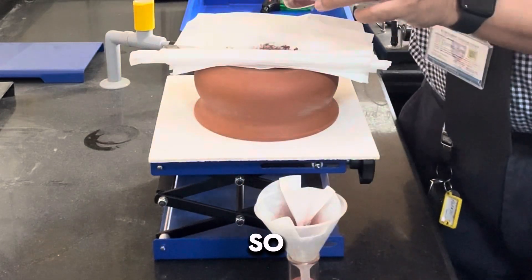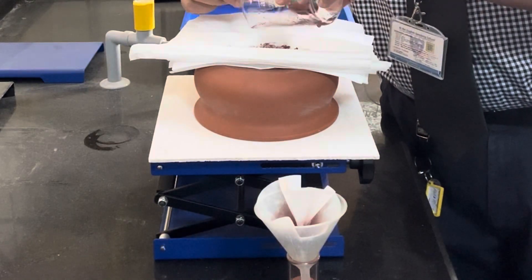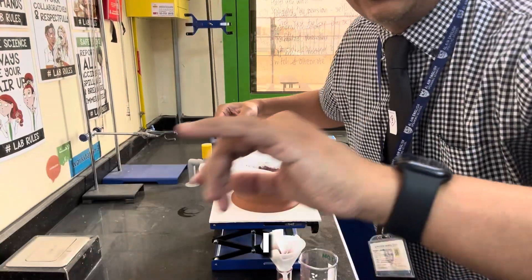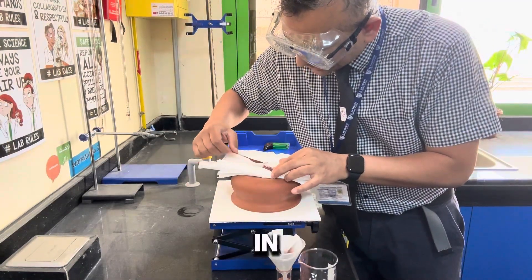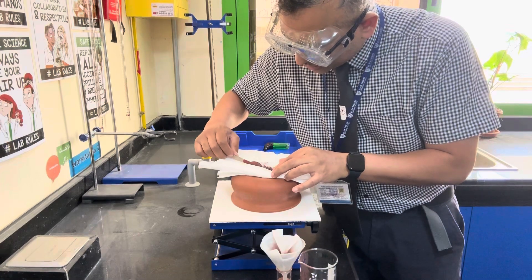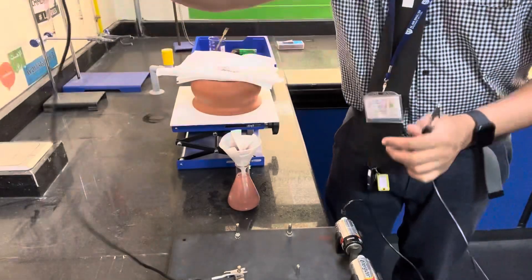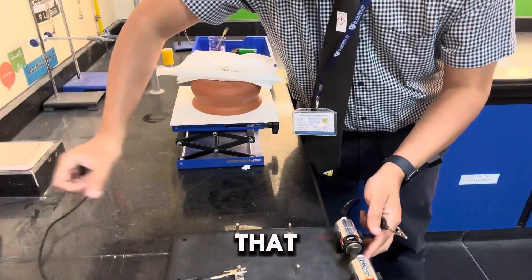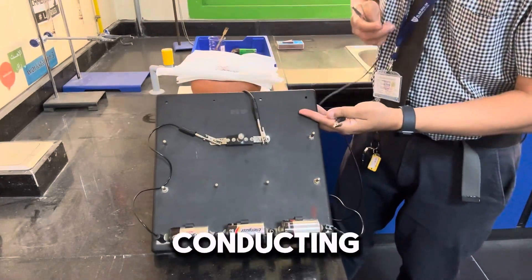I've just rinsed off the acid, so the only thing that is left over is this powder. I have to do this really, really carefully now, because what I want to do is get it in a line. We're going to see if my light bulb lights up, and if it lights up, that means that I have a conducting material.